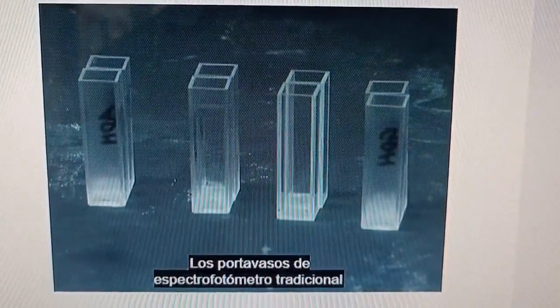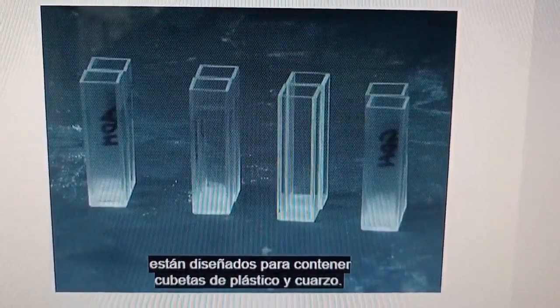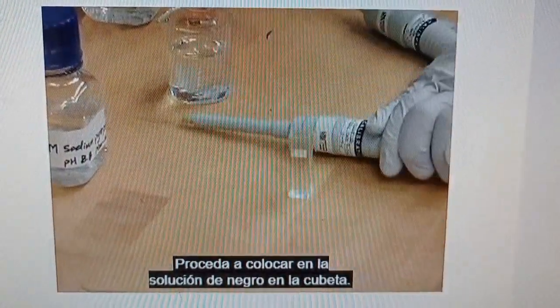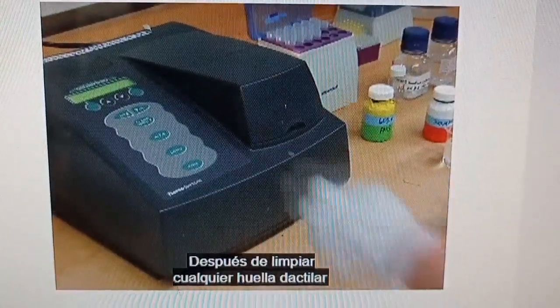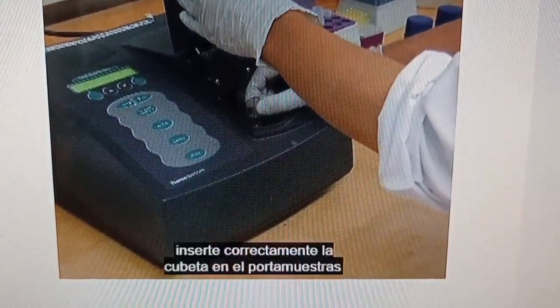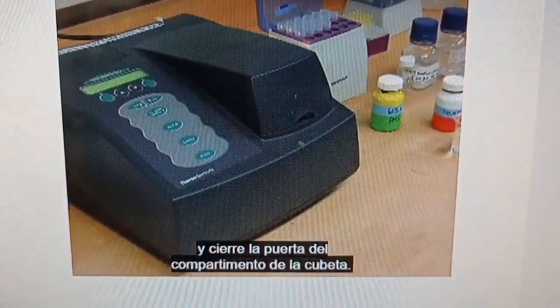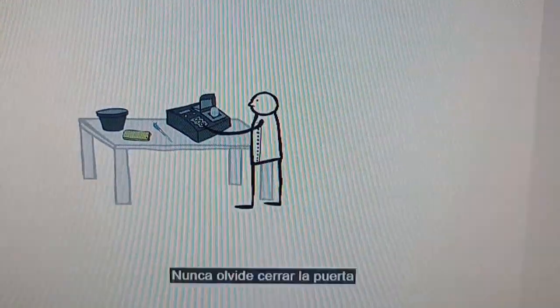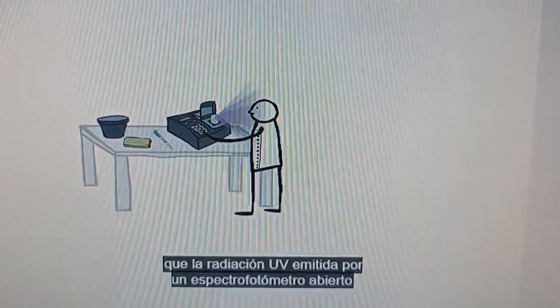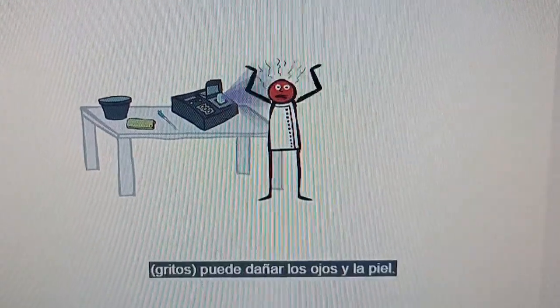Traditional spectrophotometer sample holders are designed to hold plastic and quartz cuvettes. Proceed to pipette the blank solution into the cuvette. After wiping any fingerprints and spills off of the outside of the cuvette, properly insert the cuvette in the sample holder and close the door to the cuvette compartment. Never forget to close the door to the cuvette compartment, as UV radiation emitted from an open spectrophotometer can damage the eyes and skin.